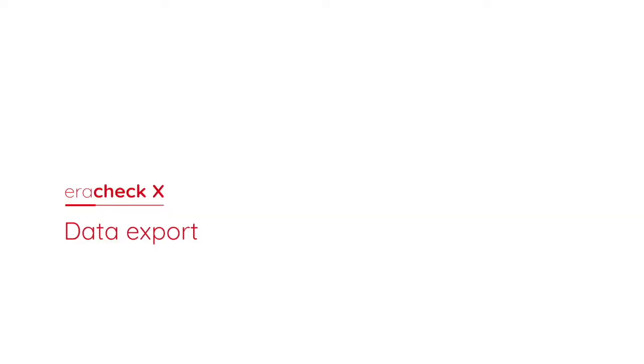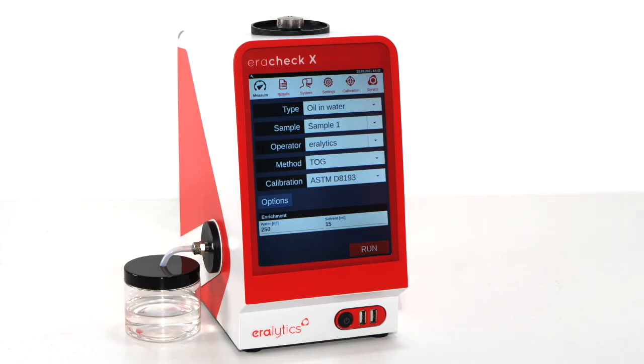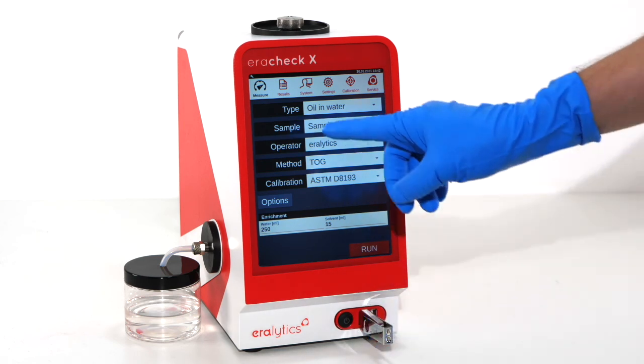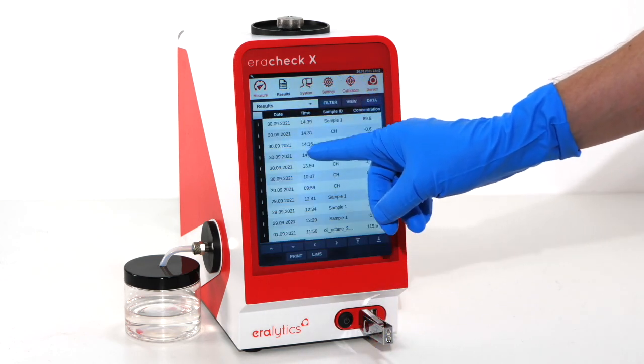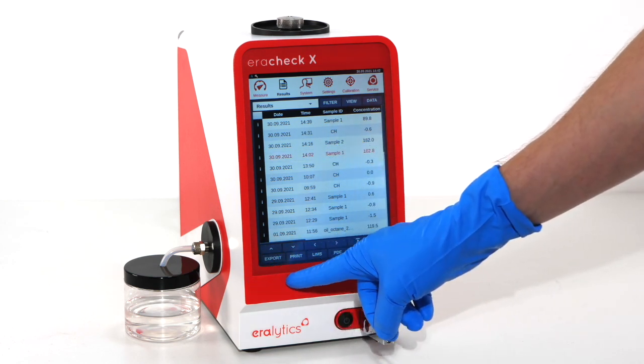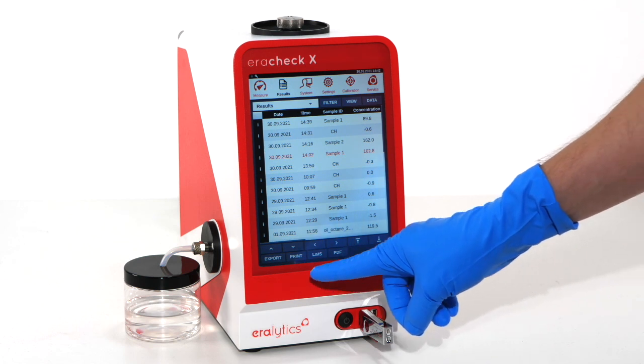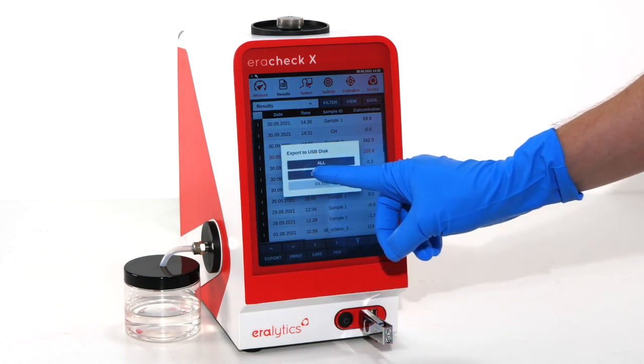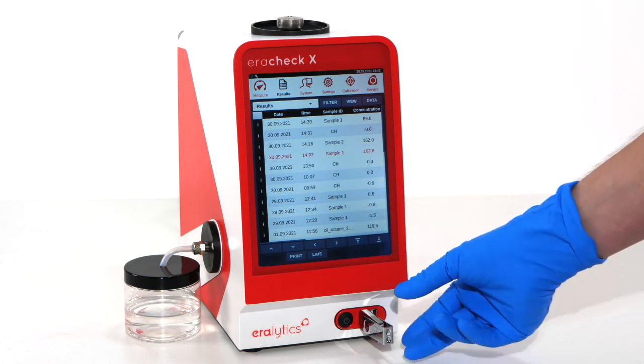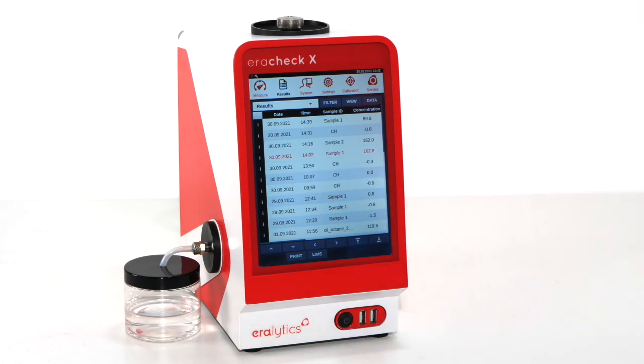Data export. Connect a USB drive to the analyzer. Select your measurement in the result menu. Press the corresponding button for the following options: Export the data as TXT, CSV or PDF to the USB drive. Print the result with a connected printer or transfer the data directly to a LIMS via Ethernet connection.